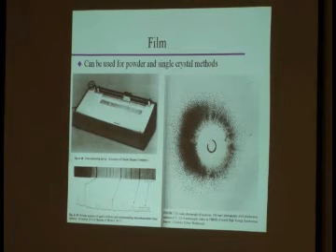Yes? Between the two methods, the image plates, can those go bad like the X-ray film? The image plates will go bad at some point in time, okay? Like everything, I mean, like a rechargeable battery, you have so many cycles, at some point in time things do get irreversible. Same holds true for image plates.